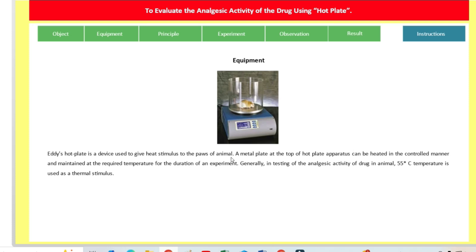A metal plate at the top of the hot plate apparatus can be heated in a controlled manner and maintained at the required temperature for the duration of the experiment. It has a hot metal plate which is heated in a controlled manner so that the temperature should be easily controlled.